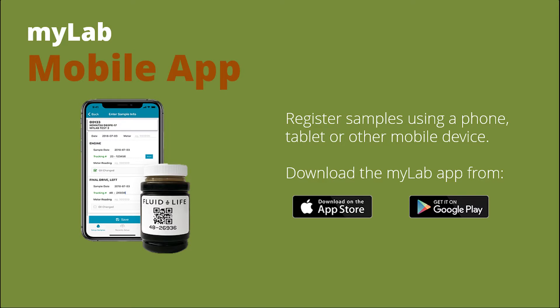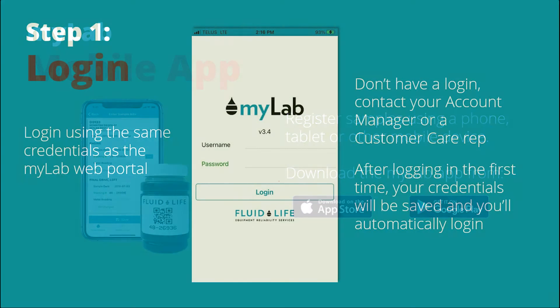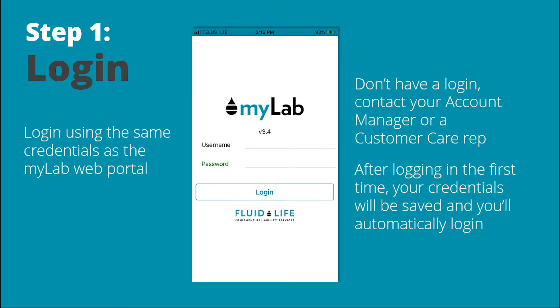Download the MyLab app from the Apple App Store or Google Play. The first step is logging in. Use the same credentials as the MyLab web portal, and if you don't have a login, contact your account manager or customer care rep.